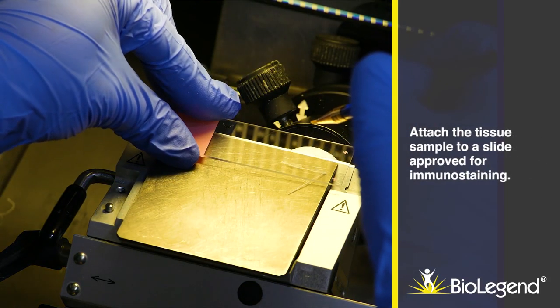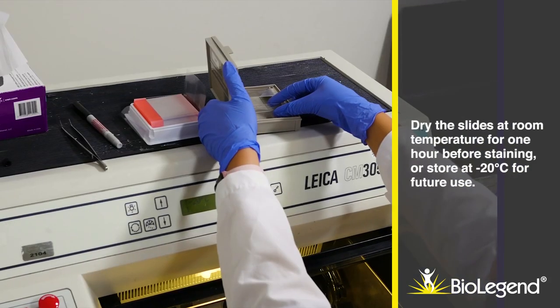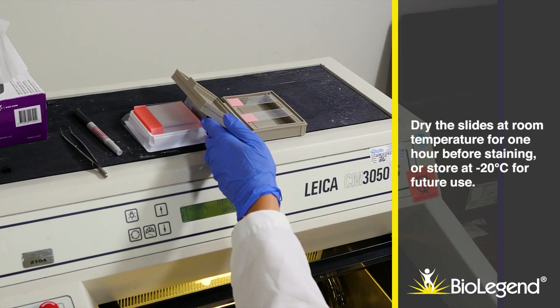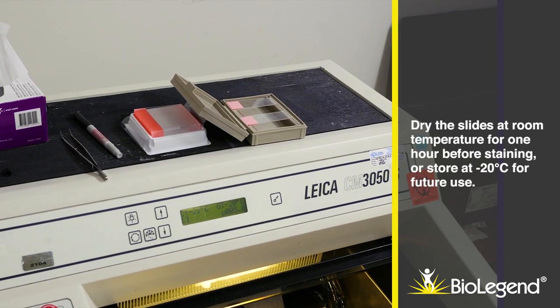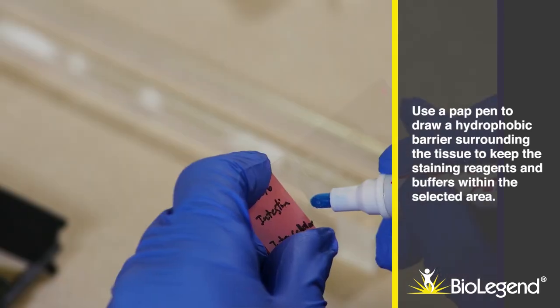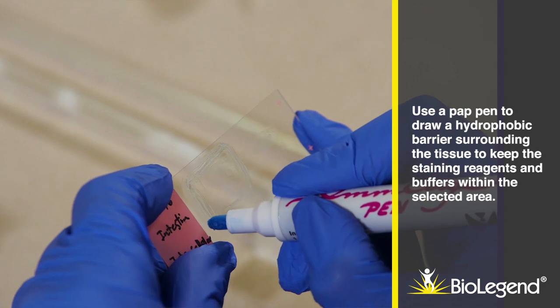Attach the tissue sample to a slide approved for immunostaining. Dry the slides at room temperature for one hour before staining, or store at minus 20 degrees Celsius for future use. Use a pap pen to draw hydrophobic barriers surrounding the tissue to keep the staining reagents and buffers within the selected area.